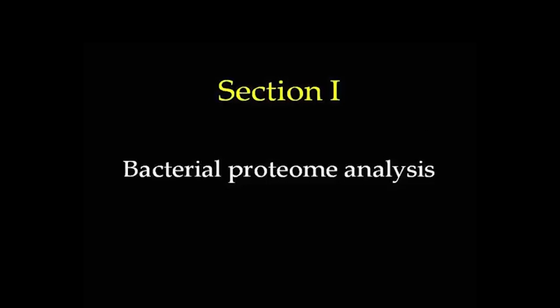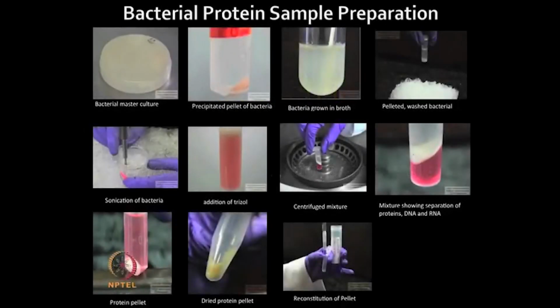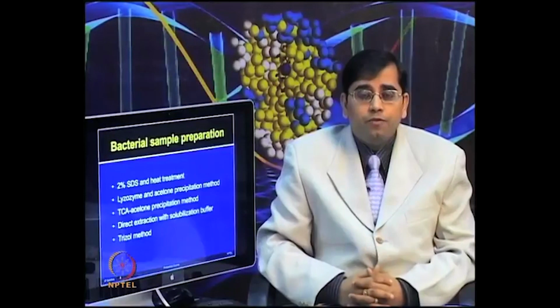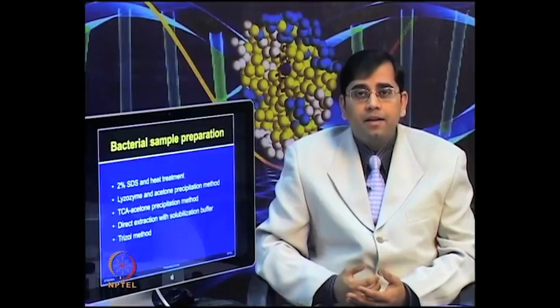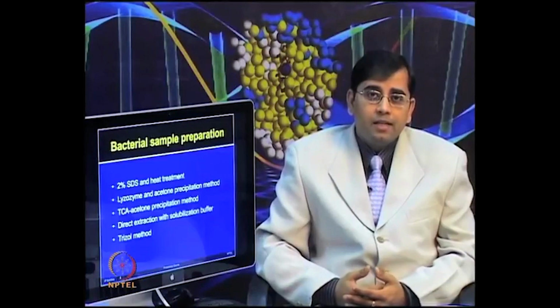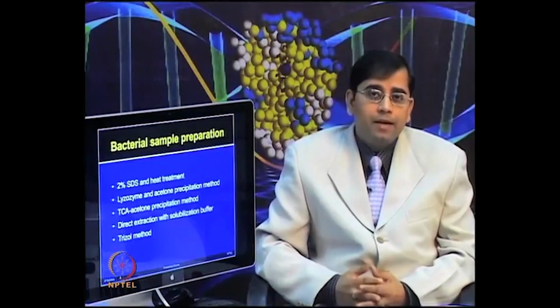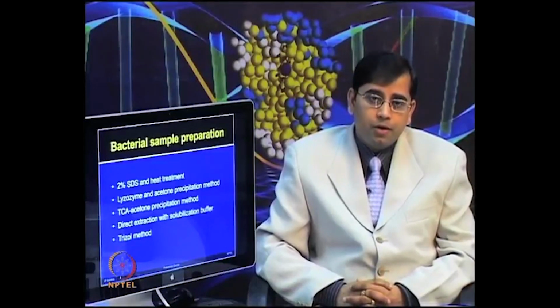Okay, so let us start with the bacterial proteome analysis. On this slide are various steps which are involved in bacterial protein sample preparation. Now let us elaborate on the different sample preparation strategies which people apply for bacterial protein extraction. These are all reported methods available in the literature. I have just compiled them for your brief overview. For the detailed protocol of each, you can refer to the detailed publications.